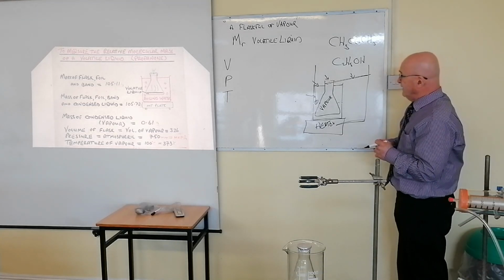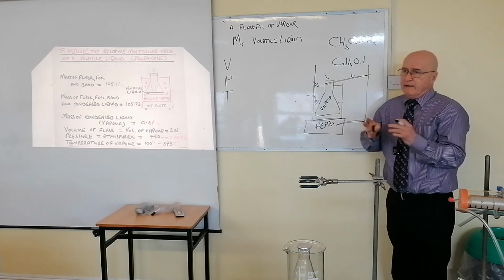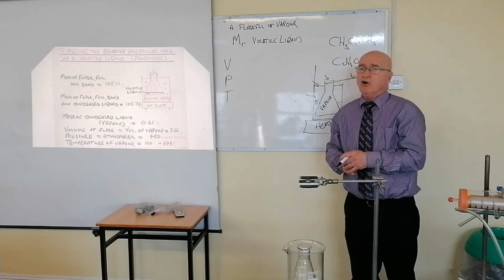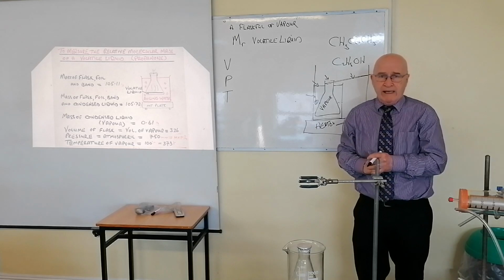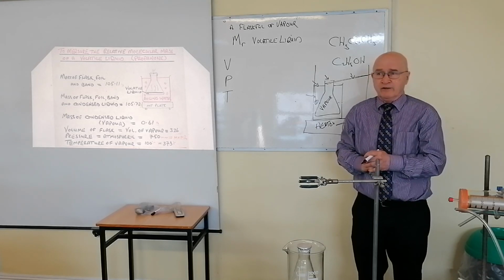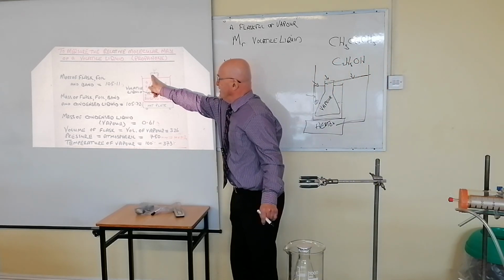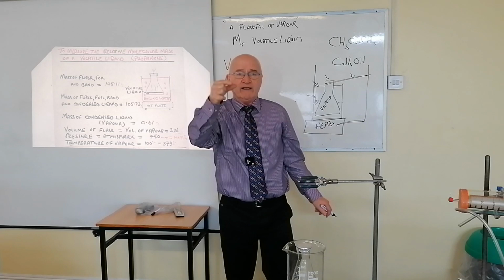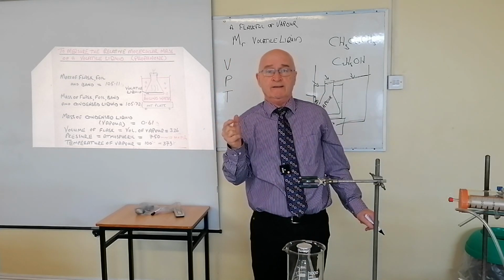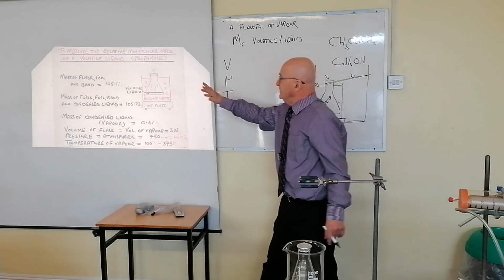Are we okay, everybody, then? That's what you'll be doing. You have to clamp it so that it's submerged. They often ask this question, what is the unavoidable error that can be made in this particular experiment? The unavoidable error. And the answer is that a small portion of the vapor is not at 100 degrees because you cannot submerge the flask in water. Now that's very important that you have a sense of that, okay? That you have it fairly high.